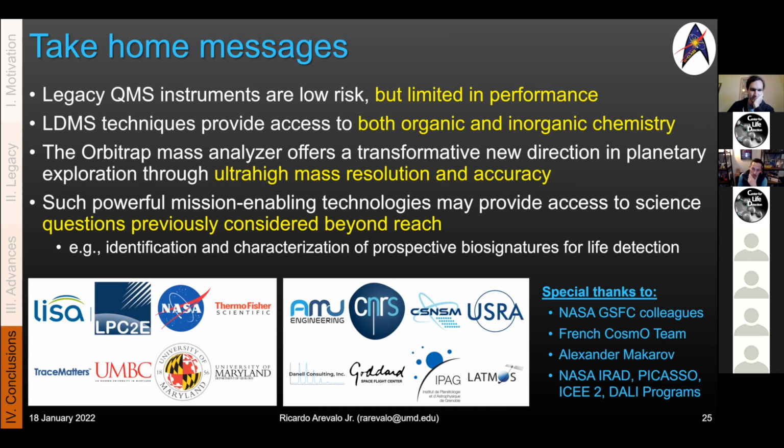Yeah, so we have empirically not observed stable isotope fractionation. We looked at potassium, for example. When I went to France, we were looking at potassium isotopes in jarosite, I think was the sample. But we've got magnesium isotopes too. We did not observe fractionation, but our error bars aren't as fine as some. For potassium, we met the SDT request for 10 per mil, and we did that on external reproducibility.